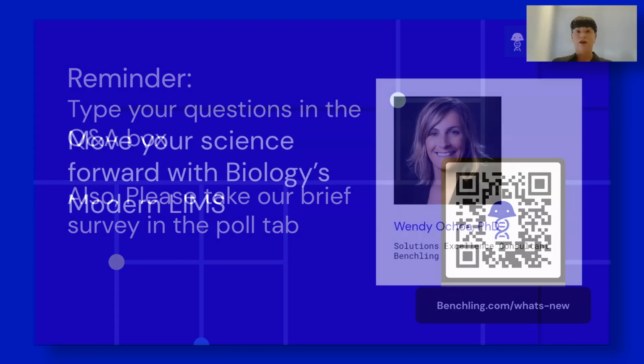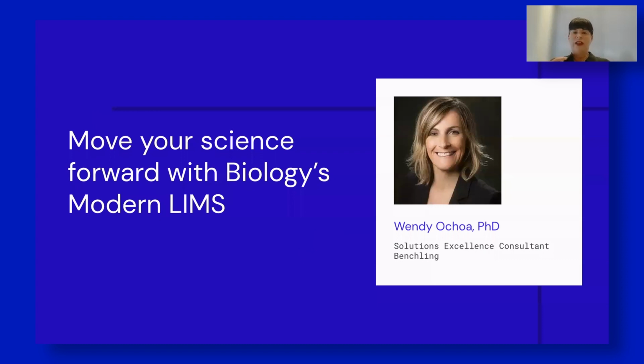For the last presentation today, we'd like to continue the discussion from our webinar last quarter on how Benchling's modern LIMS is helping researchers to move their science forward. And we gave you a peek into some of the new capabilities in workflows and large data management. And today, my colleague Wendy will now share some exciting new capabilities in workflows. Take it away, Wendy.